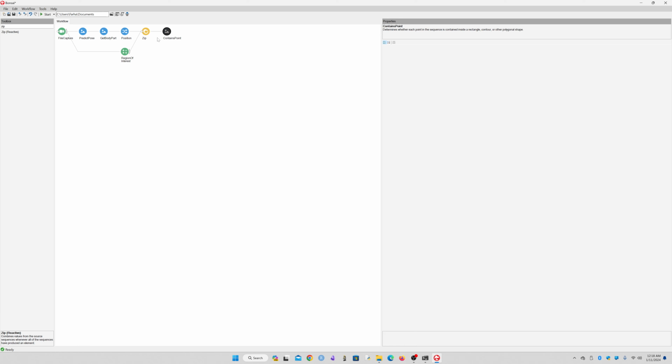So once this is created, we then need a time interval. Okay, so time interval is there.